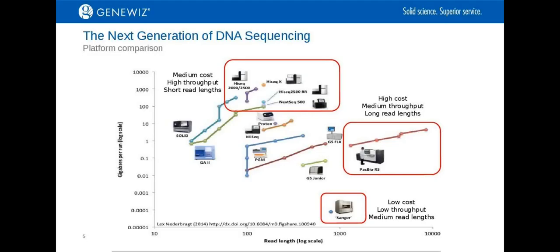First, you'll see where Sanger fits compared to other NGS technologies. Sanger is most noted for its very cheap reaction prices and 1 KB reads. However, it has very low throughput. Next, you'll see where the most popular Illumina-based NGS platforms are. These platforms are known for very inexpensive cost per base pair sequenced, extreme throughput, but relatively shorter read lengths compared to Sanger and some other NGS technologies. Their read lengths span up to 300 base pairs. These are by far the most commonly used NGS platforms.